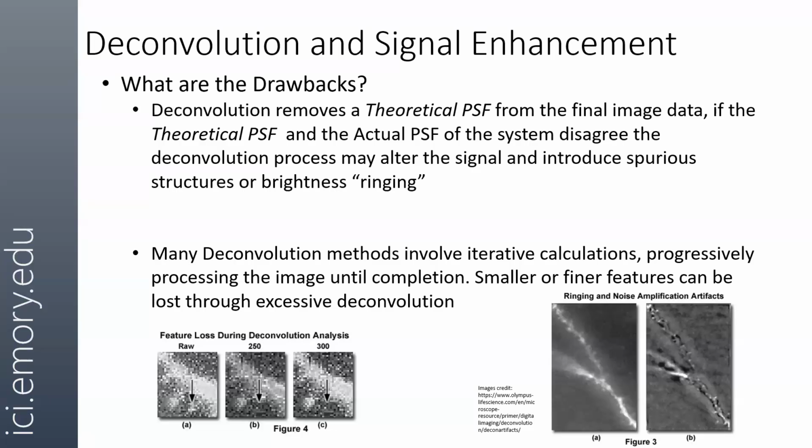In fact, some of you asked me a question about if you go too low with the top hat filter, you start seeing these stars in the background of the image that you were looking at. And that's the kind of computational artifact that can arise in some of these filters and deconvolutions. And it's something you should keep an eye out for if you're ever using this tool.